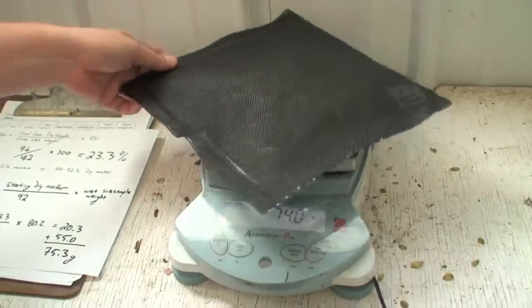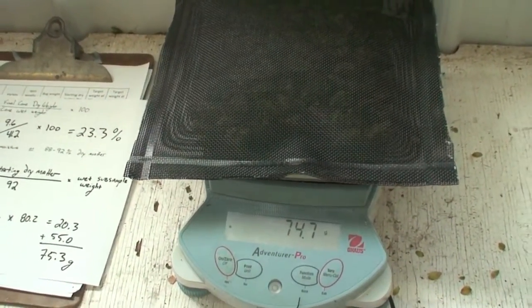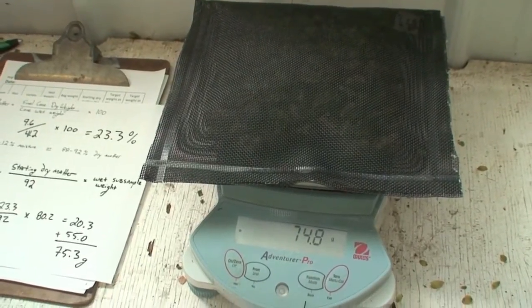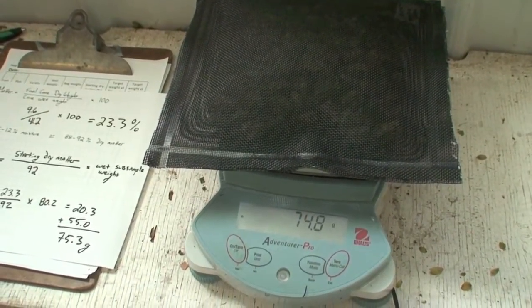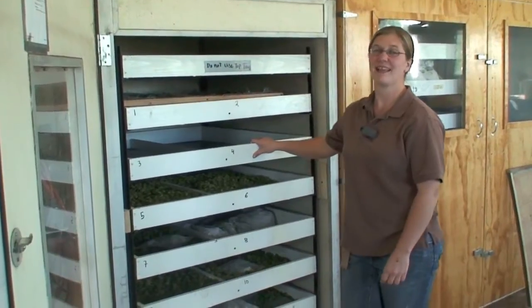We weighed our subsample bag and it's a little bit drier than that, but not too bad. That means our hops are at about 8 percent moisture, and it's time to package them up and stick them in the freezer. Ta-da!